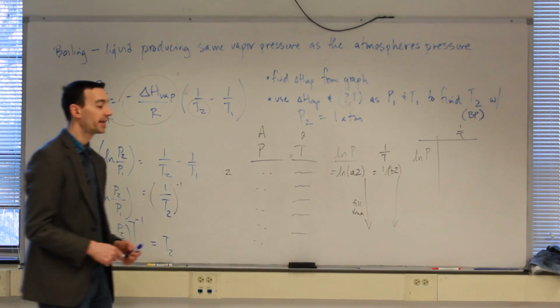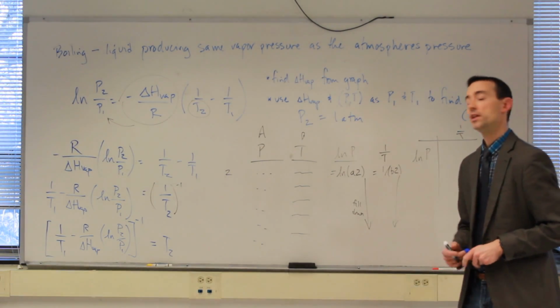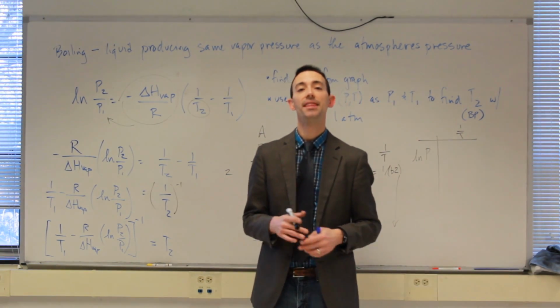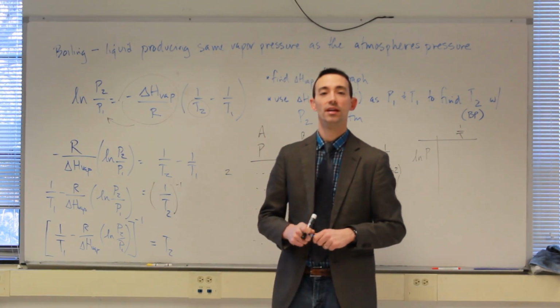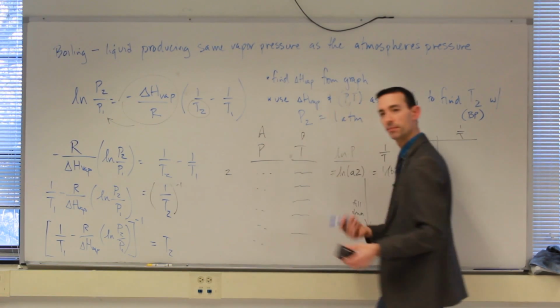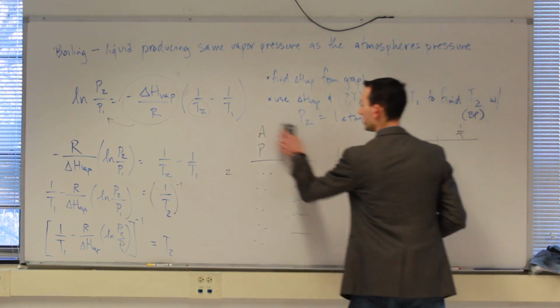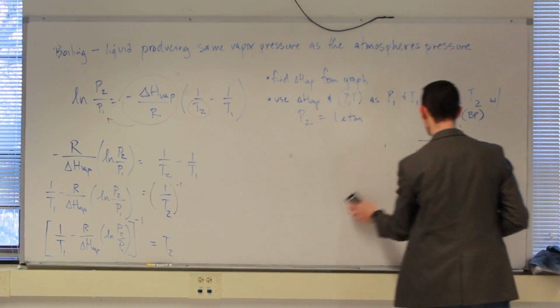Okay? And then you'll be calculating the boiling point of your liquid. So everyone will work with water sort of as a practice, and then you'll be given data for a second liquid to figure that out. The same treatment, I'm sorry, you'll apply the same Clausius-Clapeyron analysis to a different liquid. Okay? All right, so you're pretty well set.